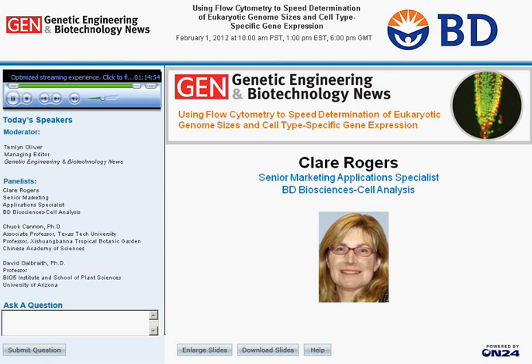And we have successfully flowed algae species that are from 100 to 150 microns through the system and not clogged the system. So you can run large particles through. The one question is whether or not you would get light scatter signals that would be on scale. If you needed to use light scatter to gate, that might be a problem. But if you're doing DNA analysis and you can trigger on fluorescence, you don't really need the light scatter to gate because you're going to gate on fluorescence positivity, then it may not matter.